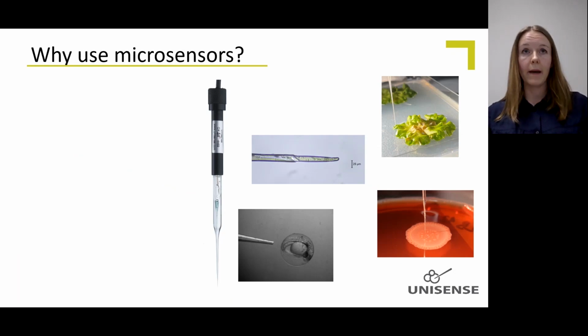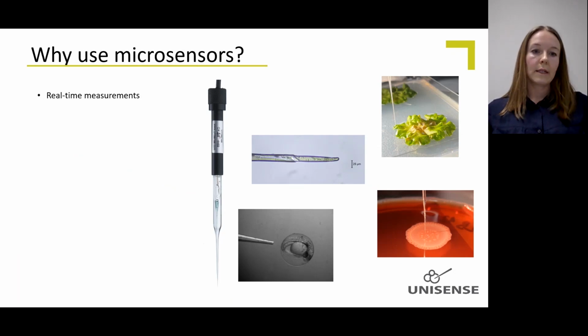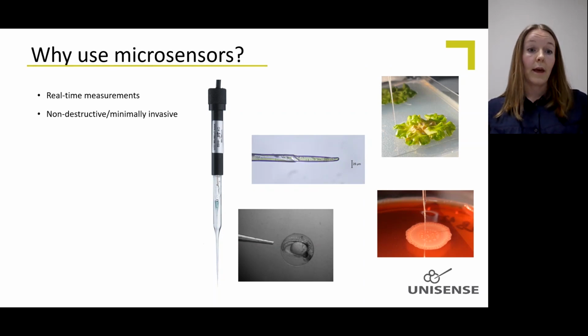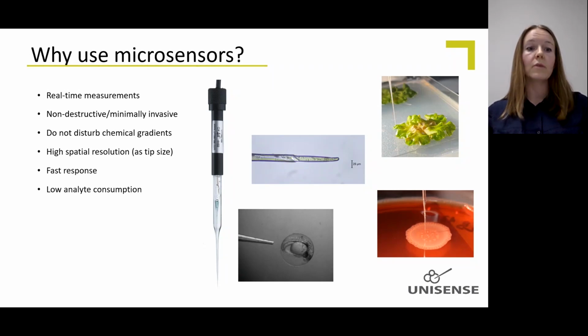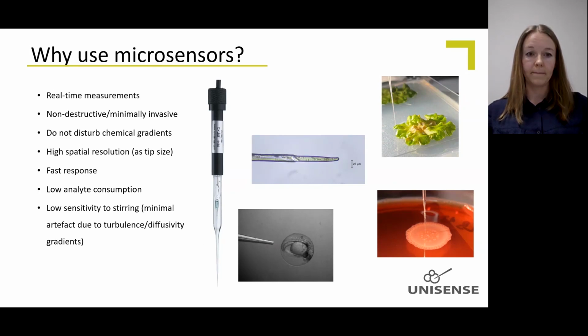So why should you use microsensors? First of all, you will get real-time measurements. This means you can follow the signal from the sensor all the time. And because of the small tip size, you get a non-destructive and a minimally invasive measurement. You do not disturb the natural chemical gradients in the sample, and you can obtain a high spatial resolution. And the rule of thumb is that the spatial resolution equals the tip size. You also get a very fast response time, and the microsensors have a low analyte consumption and thereby also a low sensitivity to stirring.